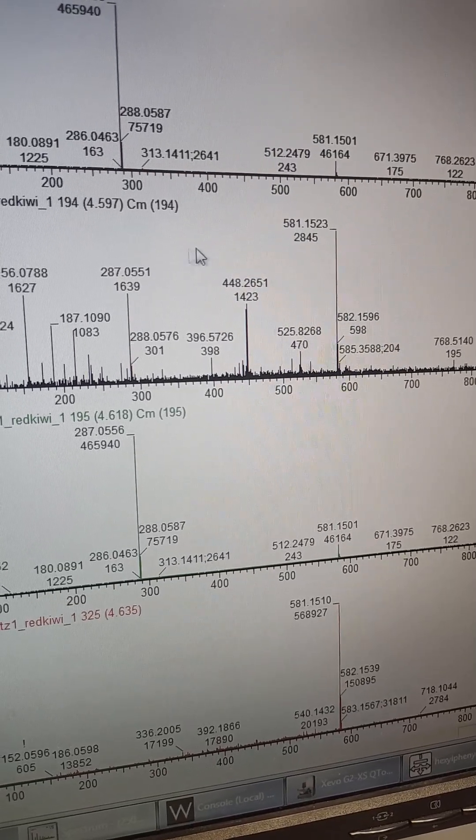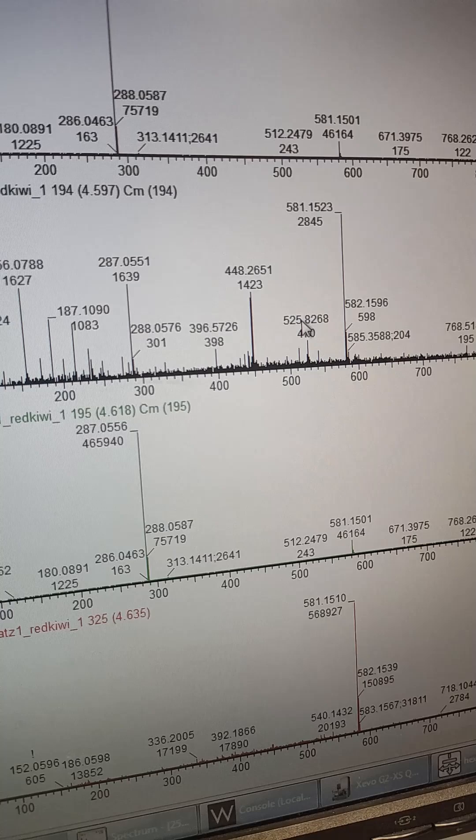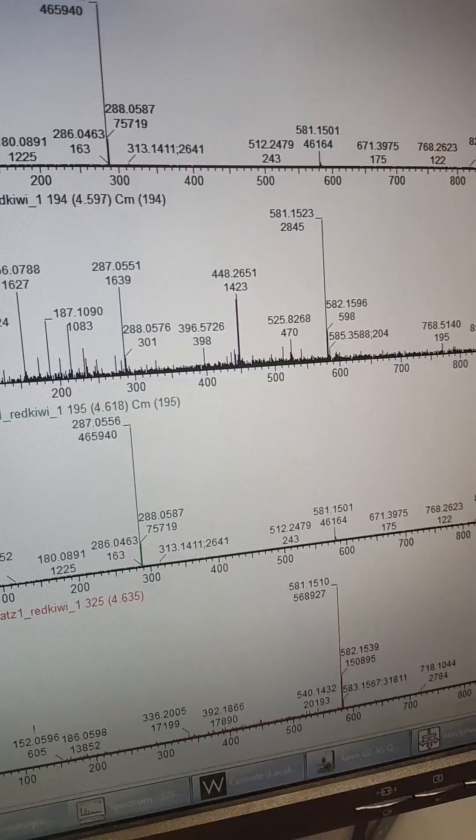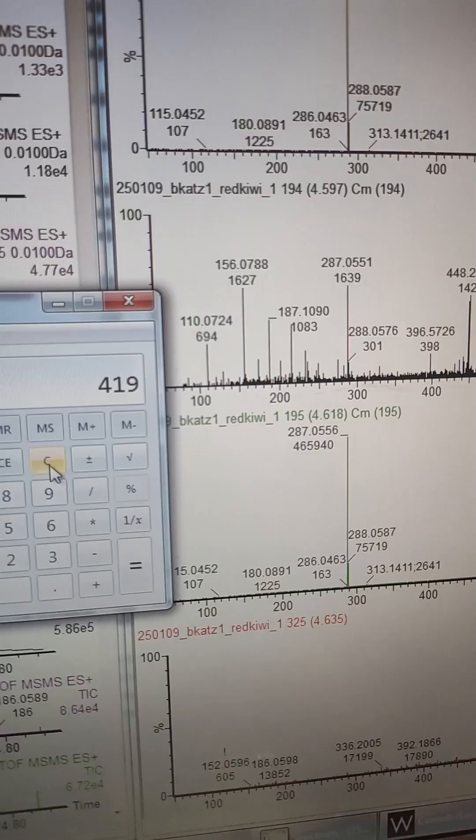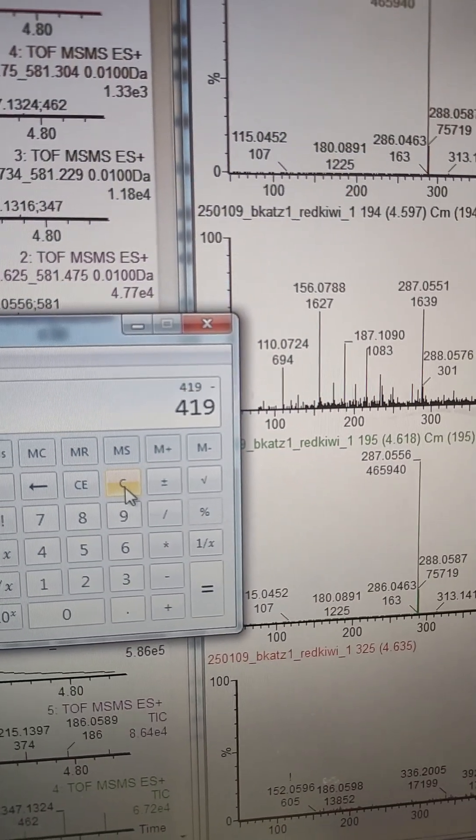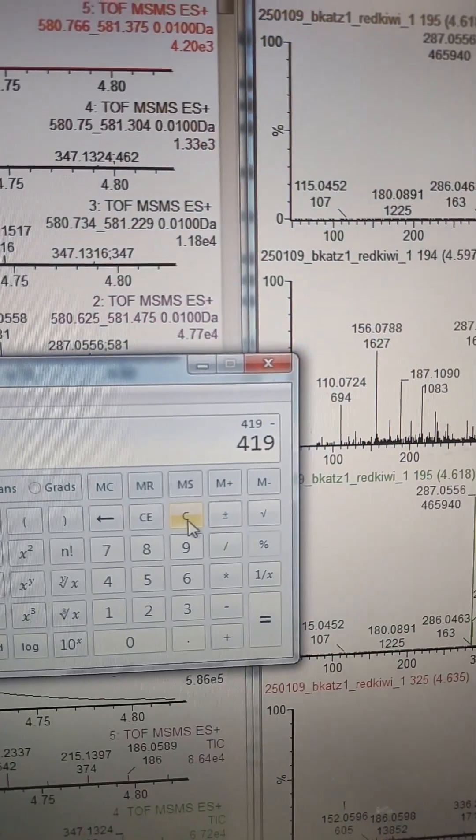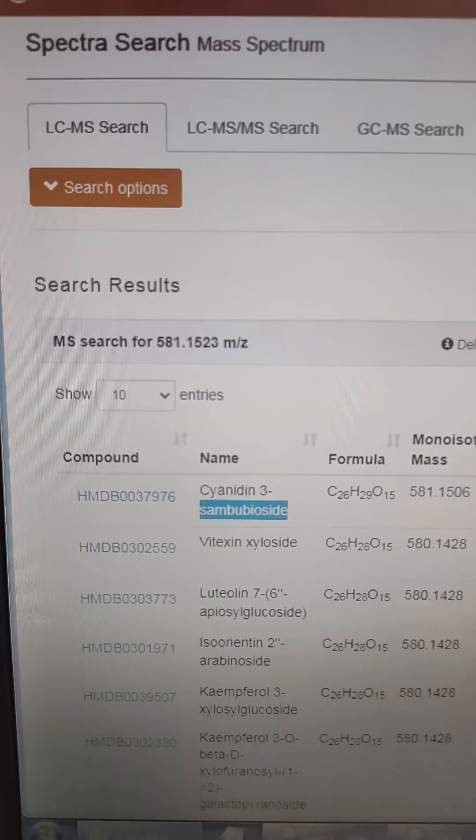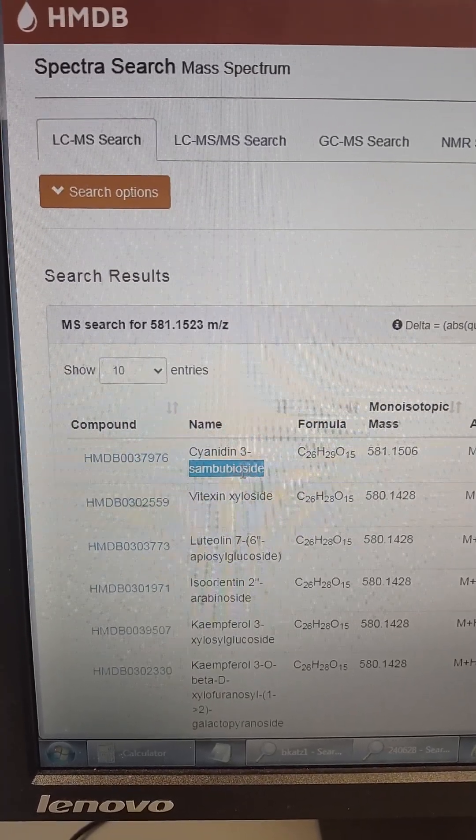So this may give us the right space. We need to figure out all the sugars and acids conjugated. So this one's a 161, maybe 162 shift. And then the next one, if that's 162, right? So it'd be 581 minus 162. 162 is glucose. And so that would be 419 minus 287. So 132 shift. That's the other sugar acid. HMDB is getting it as well. Except it's using the trade name Sambubioside.